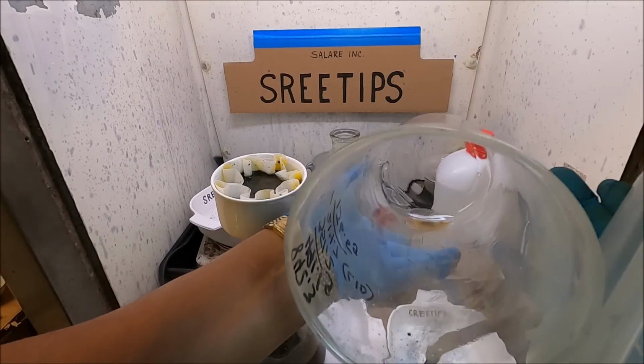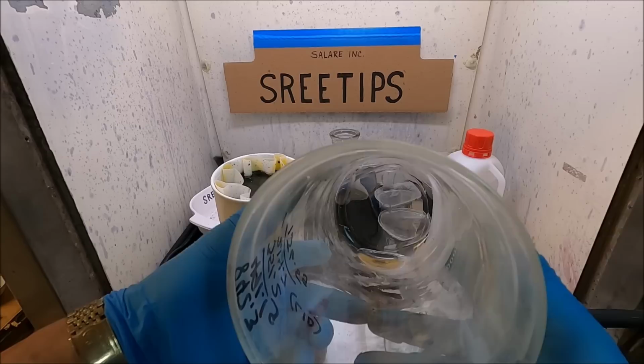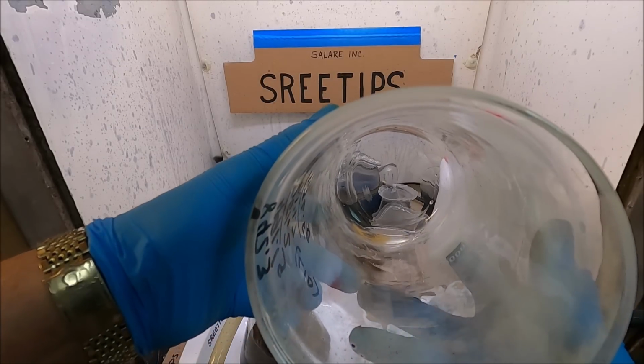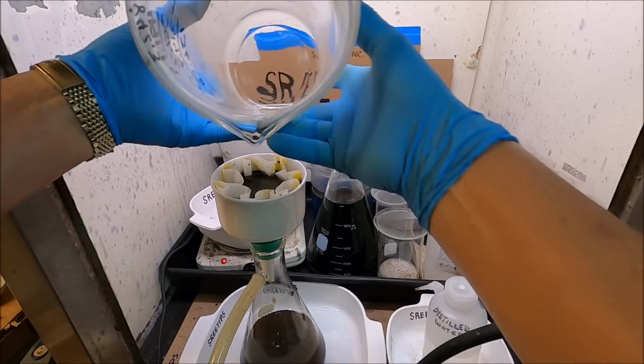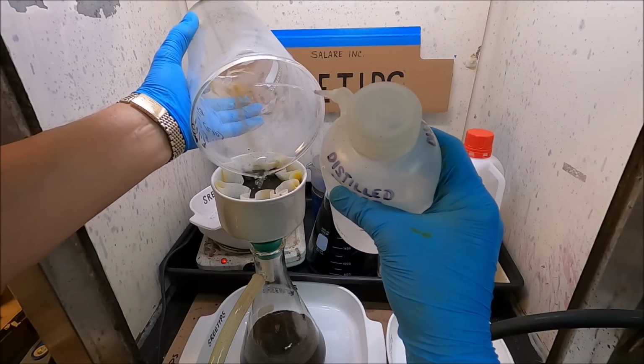Got some neat looking material down in the beaker down there. It looks like it's gold, glittering. Not quite sure what that is. Looks like flecks of gold. I'm gonna rinse that into the filter also. Get everything in the filter.